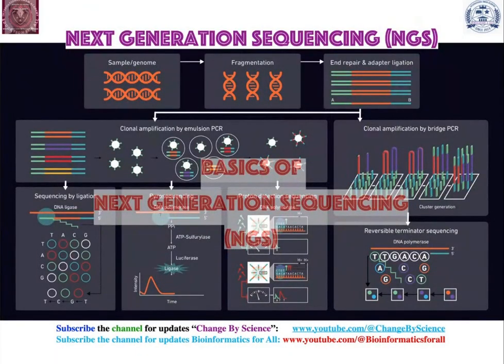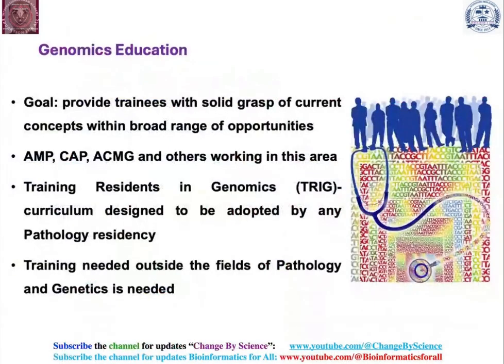So now, to summarize, you have to understand the basics of NGS application for genomics understanding and a quite broad range of precise and high accuracy applications and predictions. So you need to understand the fundamentals of NGS application, what the project goal will be, and which tools you need to select depending on your final goal. So this is overall what you need to understand: the fundamentals of NGS and its application.